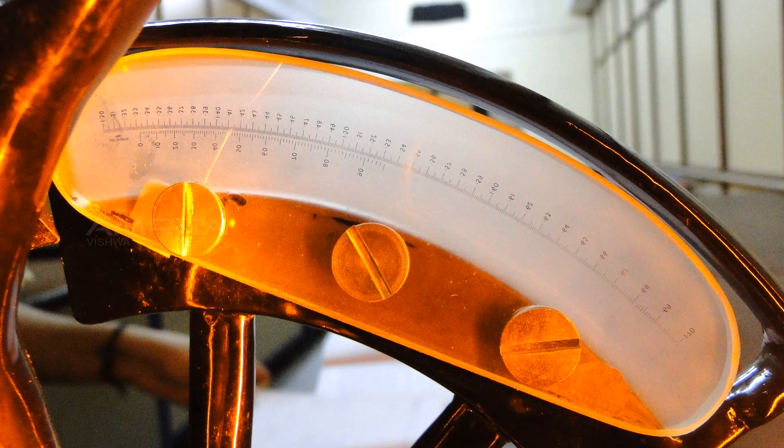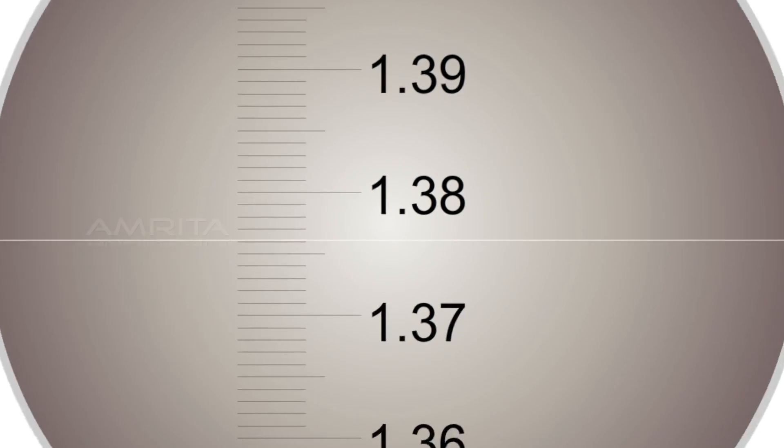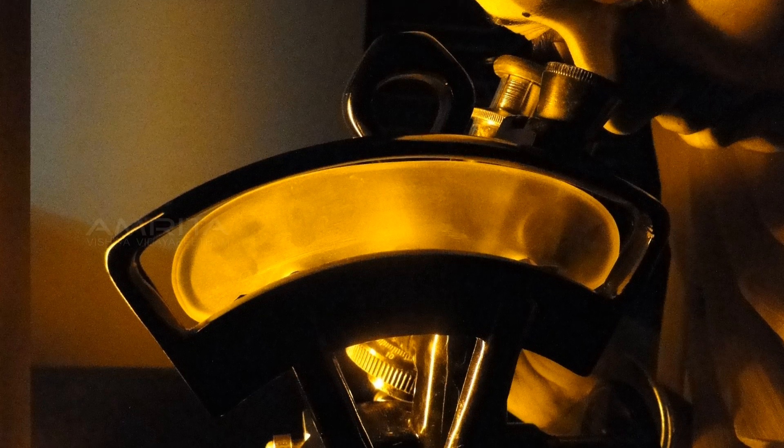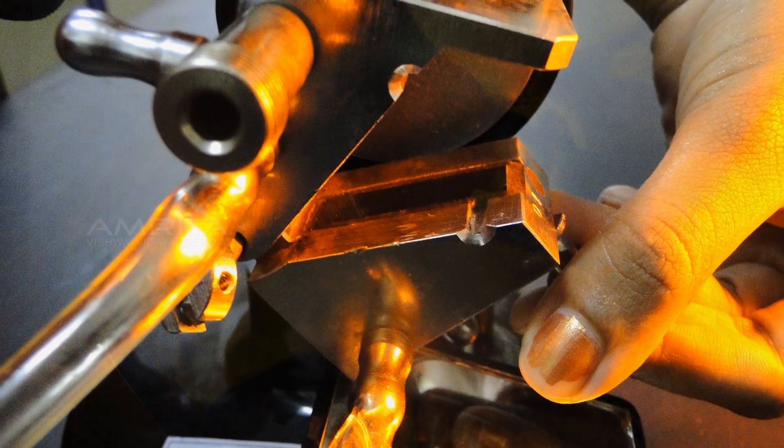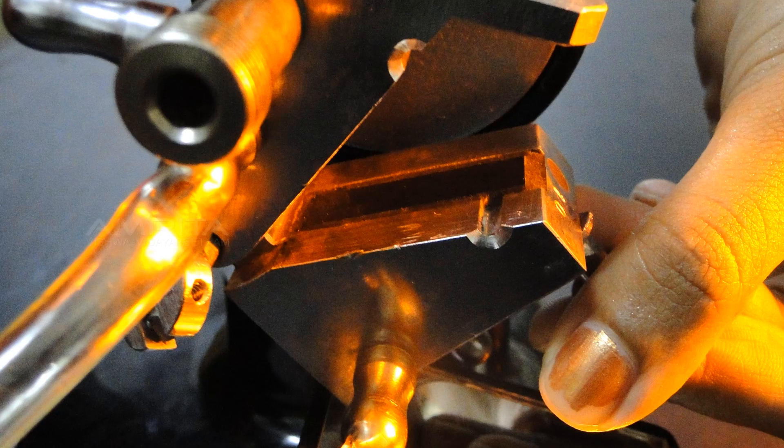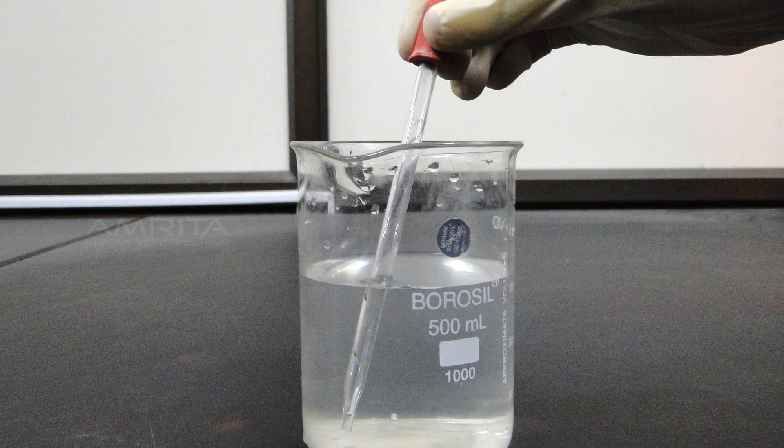Read out the integer value from the rough scale and the decimal number from the refined scale. Read the index of refraction using the telescope scale. Open the double prism and dry out glass surfaces. Repeat the experiment with different liquids.